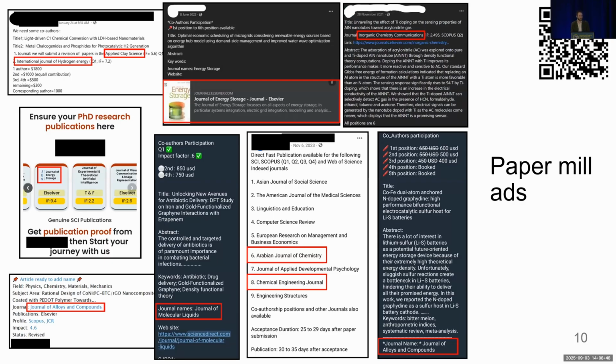Thank you. Hi, Tim Miller from Boston Children's Hospital. I'm wondering if you could take the subset of the data where the metadata is in the image and use it to train a classifier to distinguish between different machines, and then apply that classifier to the rest of the data and see whether the non-metadata images also have this problem.